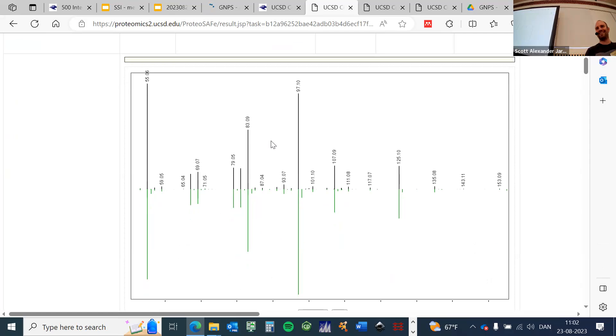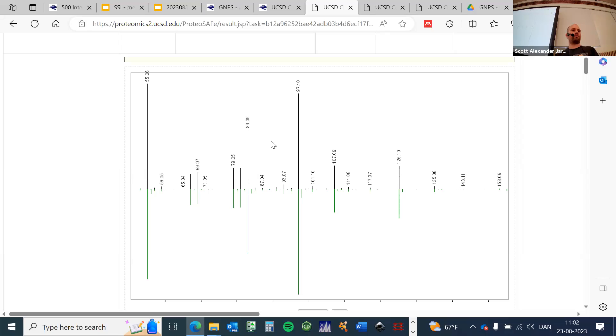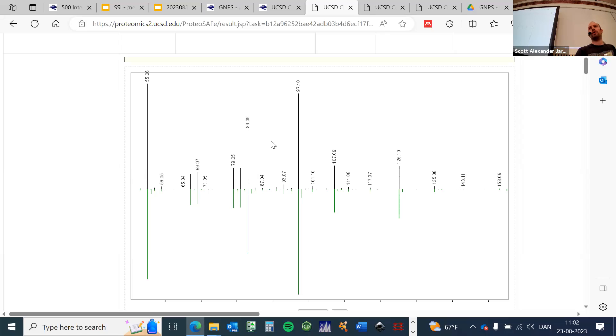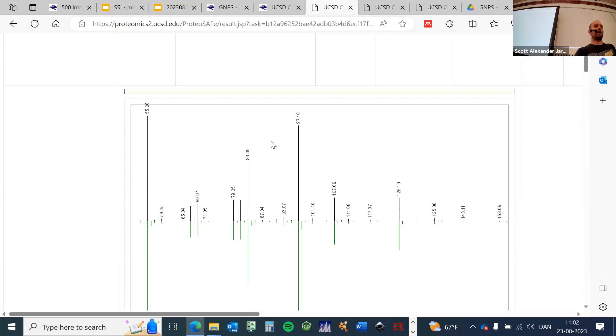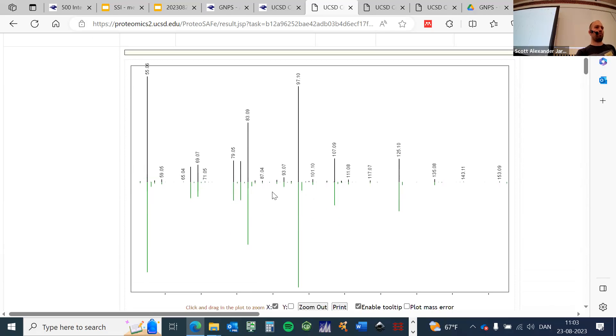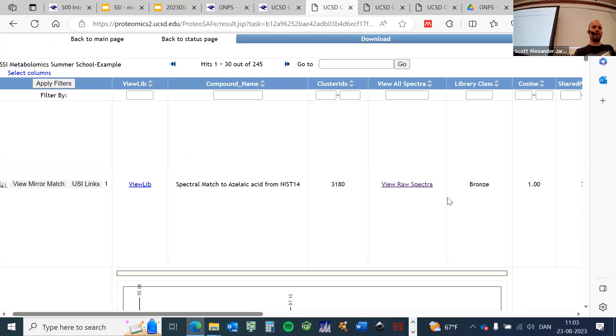I would strongly encourage you to do that, especially before you write the name of this compound into your manuscript. Manual verification or inspection is important. Obviously, if you want to do this with 500 molecules it gets challenging, but if you identify something as a putative biomarker, you want to show something like this. You want to inspect it and then put this in your figure. That gives confidence.